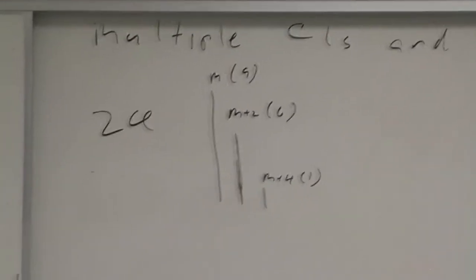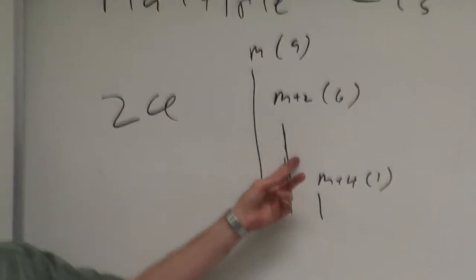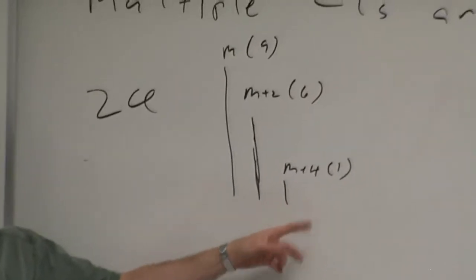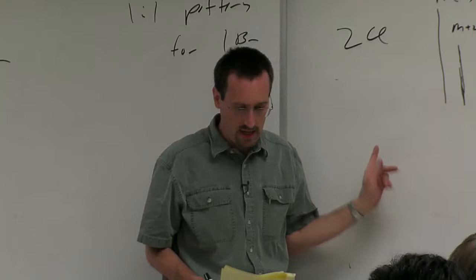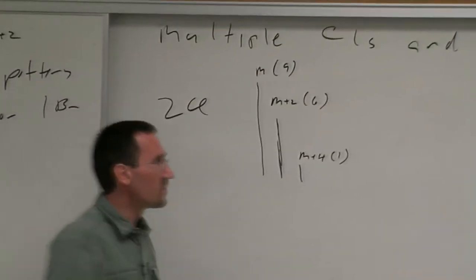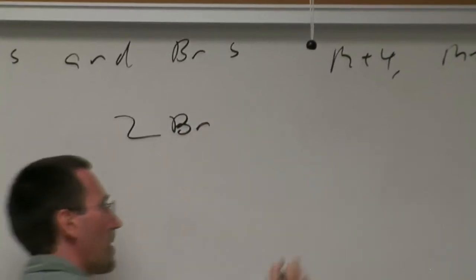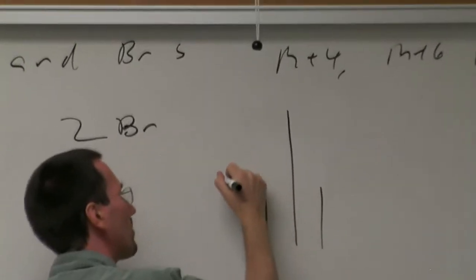And you look at something and you say, hey, this looks interesting. There's this really big M+2 peak that I wouldn't expect, this really big M+4 peak, and then you think, oh, it's got to be some element with a substantial amount of isotopes. If you have 2 bromines, then you'll see a pattern that goes in about a 1-to-2-to-1 ratio.